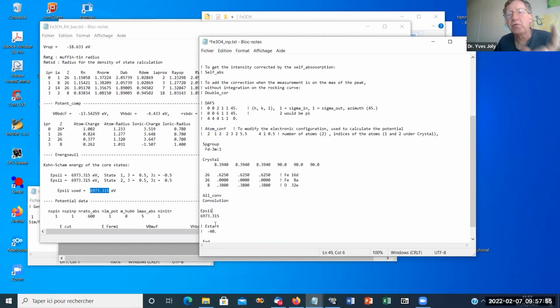Yes, and I forgot to mention, if you want to be precise, especially if you compare different oxides, calculations must be self-consistent, because otherwise the electronic structure is not sufficiently well calculated. And so you must have written SCF somewhere in all your calculations. Voilà. We did that, for example, for different kinds of manganese oxide, and it works rather well, I would say.